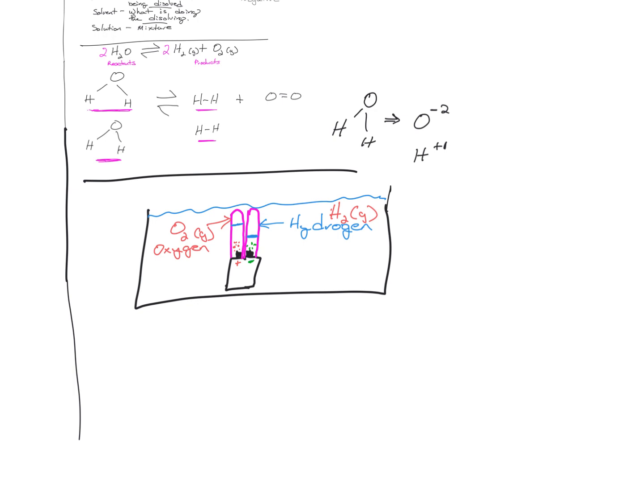So now you've got these two nibs. One person's going to hold the positive. You put this in there, and it's going to be a violent reaction, should be. And you can see it is. And you put them over, and you start collecting the gas. As you collect the gas, the water gets pushed down. On one of them, you'll have hydrogen, and the other one, you'll have oxygen. Again, according to our hypothesis.